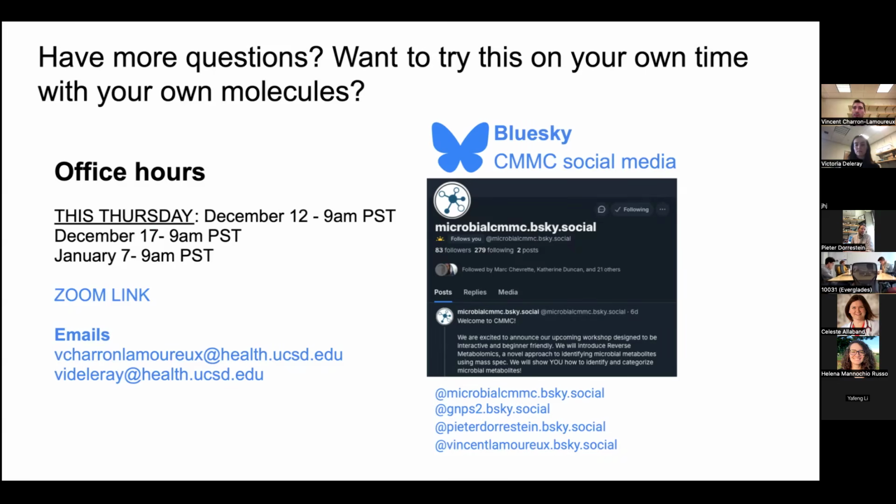Microbial mass will be expanded to do 2 things. One, that you can go from the gene side and learn a little bit more about what molecules may be co-occurring with specific genes. But that will take a little bit longer to build. But also anything you care about in terms of microbiome analysis. Does your specific molecule change in the context of diet?